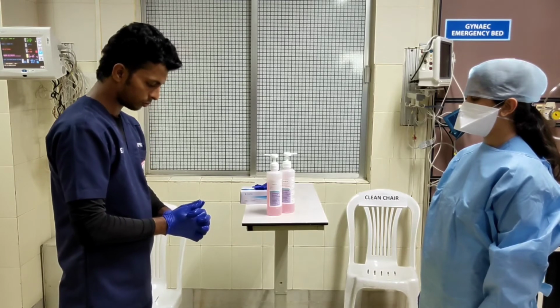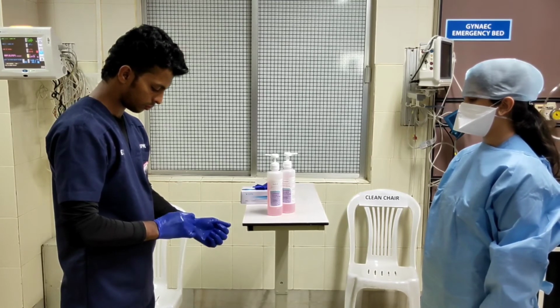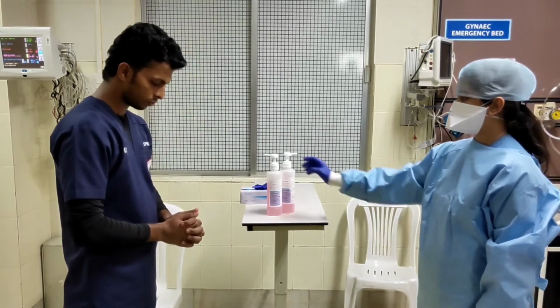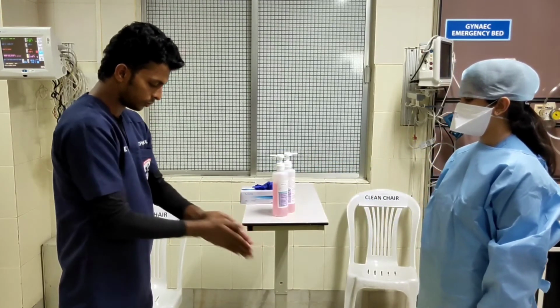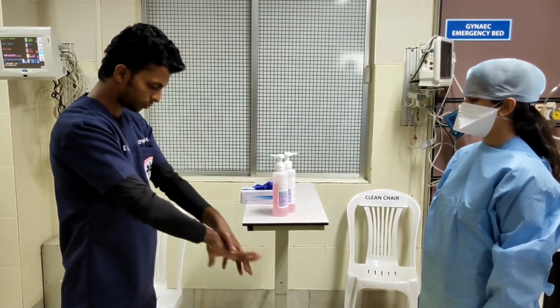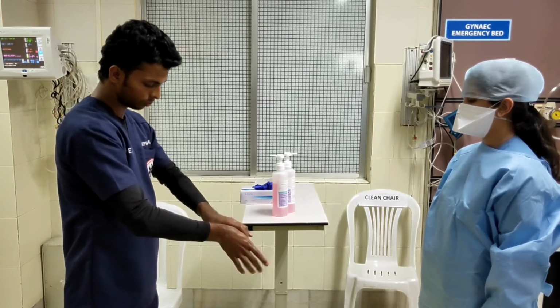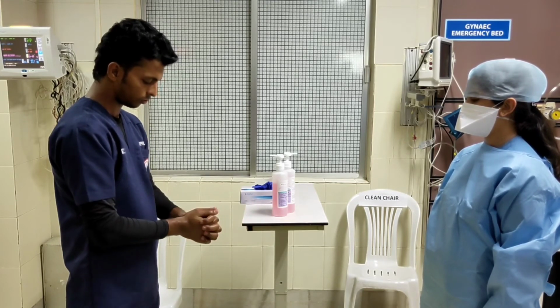Once you have done disinfecting the gloves, you can remove the gloves like how you removed the earlier gloves. Now do a proper hygienic hand wash with a hand sanitizer. Once you have done disinfecting your hand, you can thank your spotter for their assistance and then exit the doffing area.